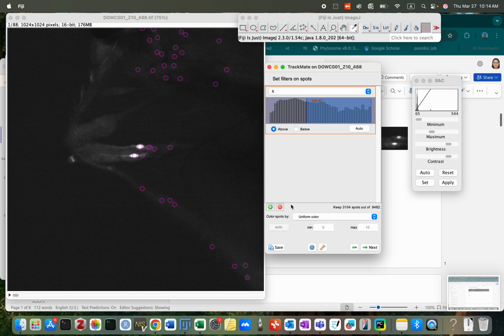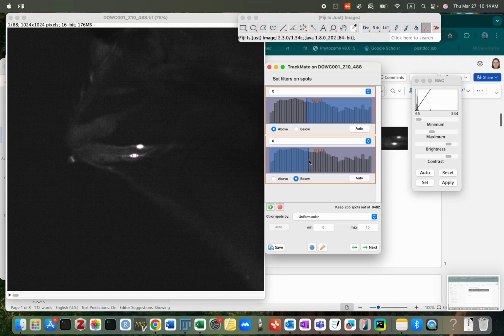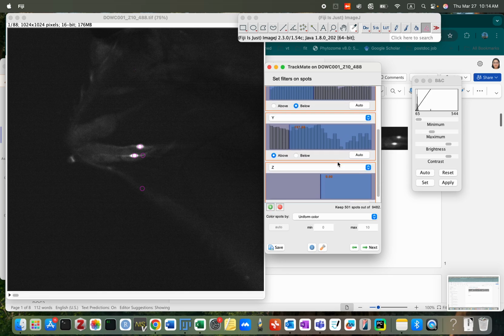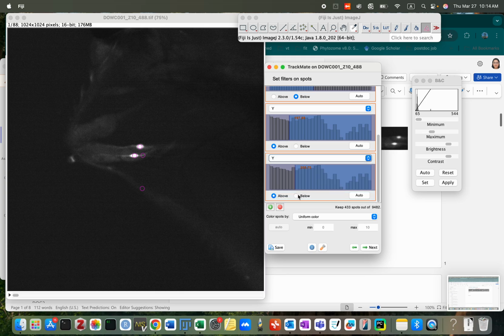let's do it this way. Now I set the other direction of X. Play with it and narrow down the X value. Now I can set the Y direction, to move the cells out. Good. And then I set another direction for Y. I see something below, so I filter those cells out. I need to filter the cells out.